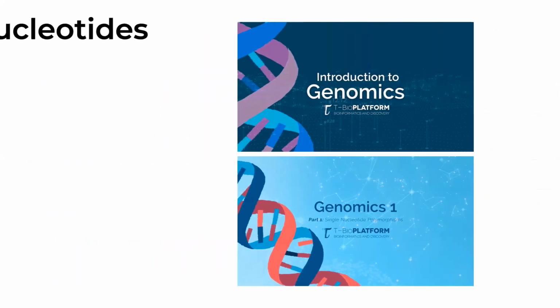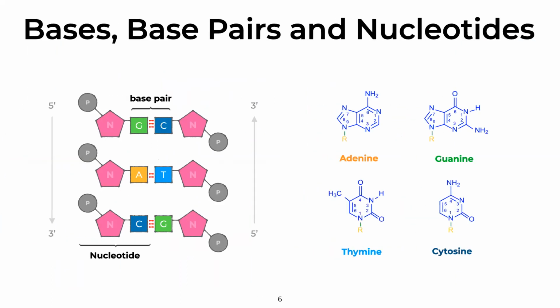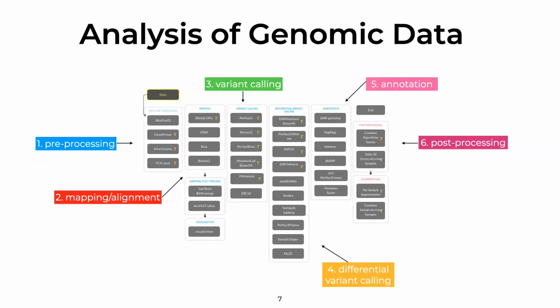So what we talked about last week is how mutations at the nucleotide level correspond with amino acid level. And to detect those mutations, there's a number of bioinformatics pipelines. So this week, we'll be talking about genomic data, next generation sequencing data. That data has to be prepared for analysis before we can actually identify those mutations.